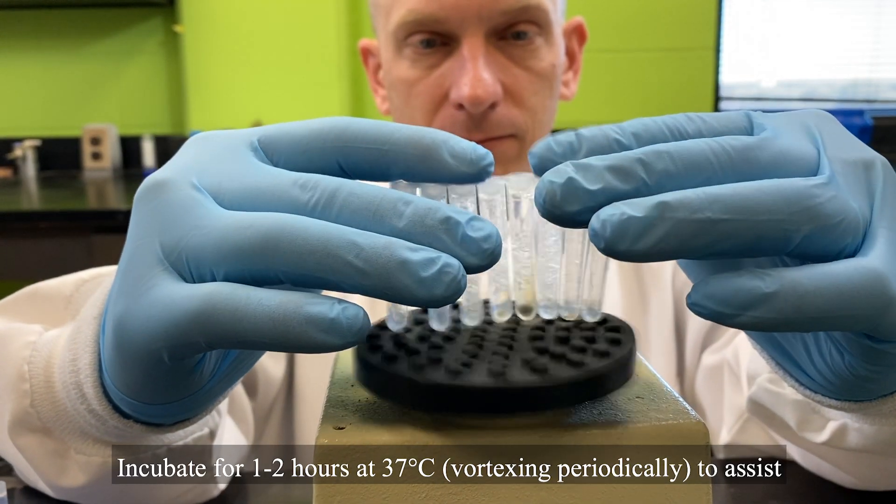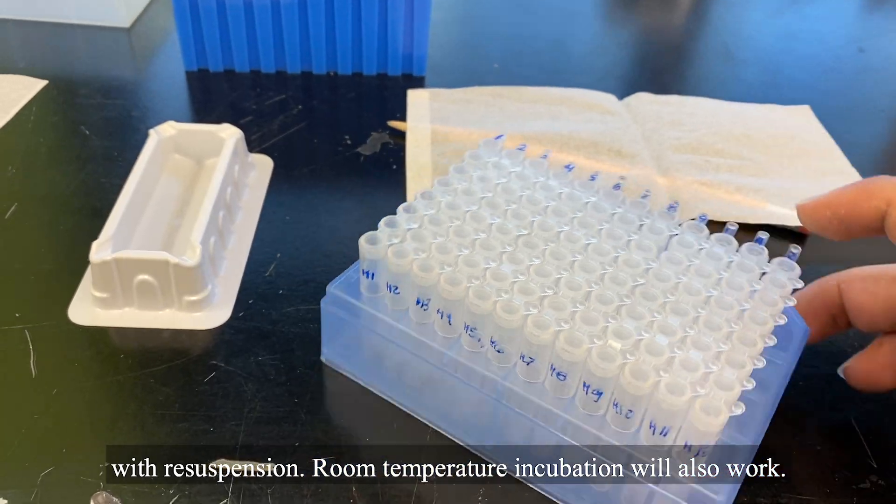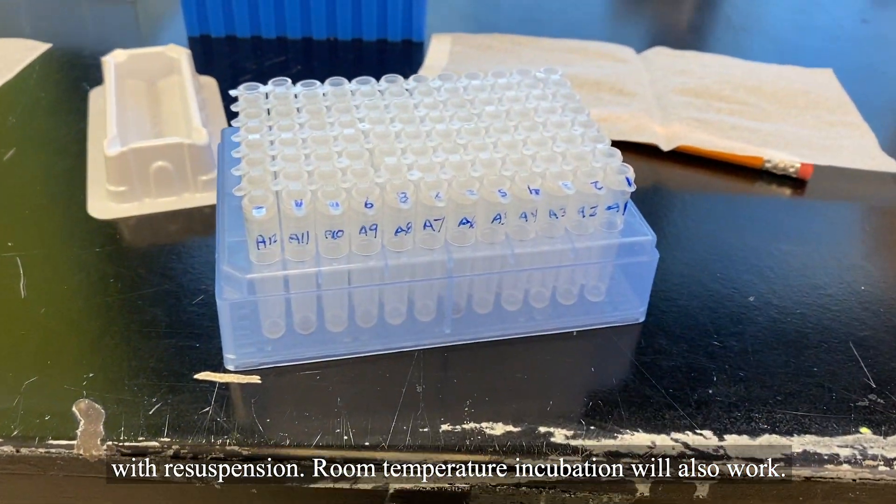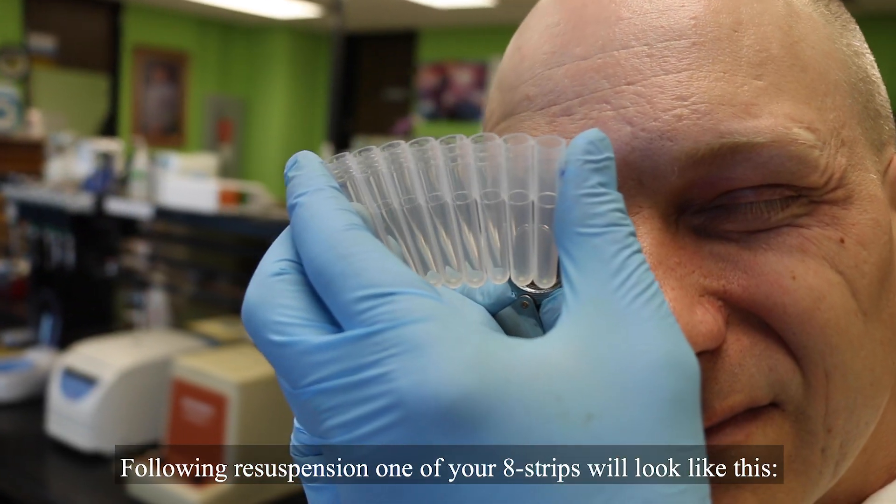Incubate for 1 to 2 hours at 37 degrees Celsius, vortexing periodically, to assist with resuspension. Room temperature incubation will also work. Following resuspension, one of your 8-strips will look like this.